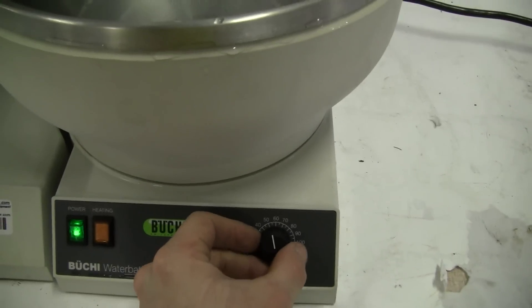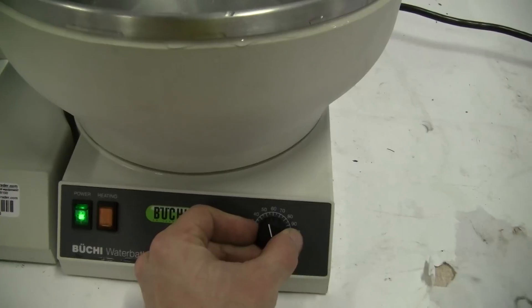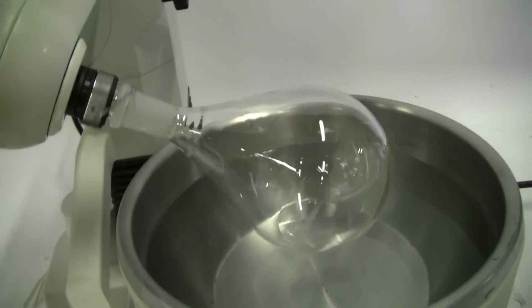Our water bath is not heating right now — we're at our set point. There we go, kick the heat on. It comes back down, the thermostat kicks in nicely. It's running nice and smoothly right now.